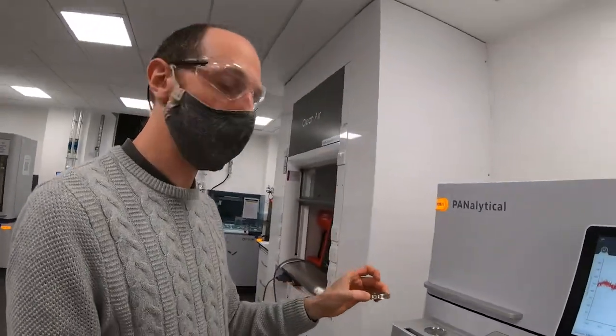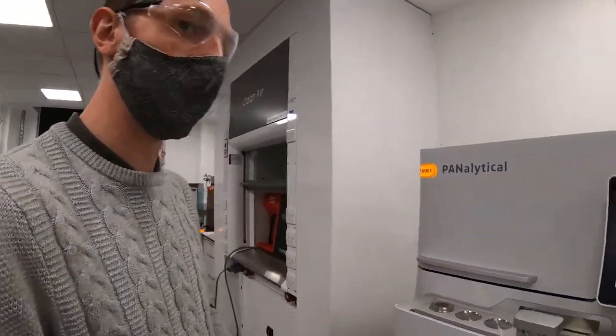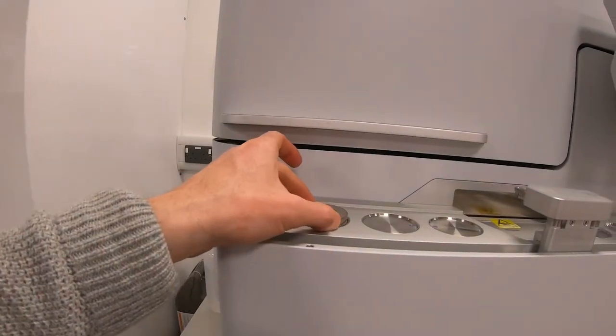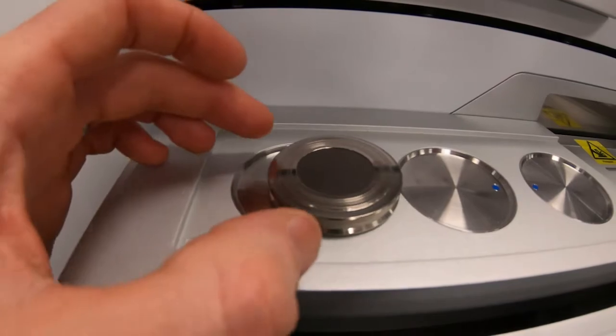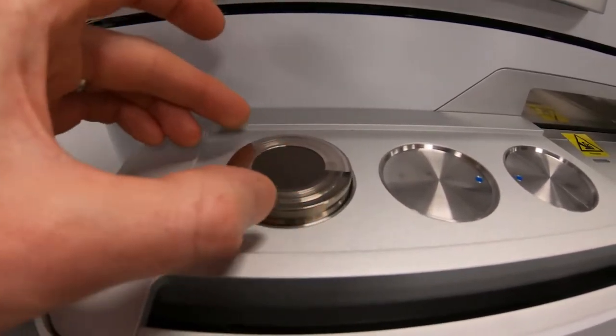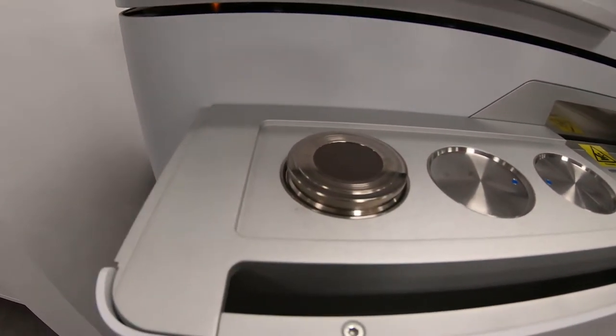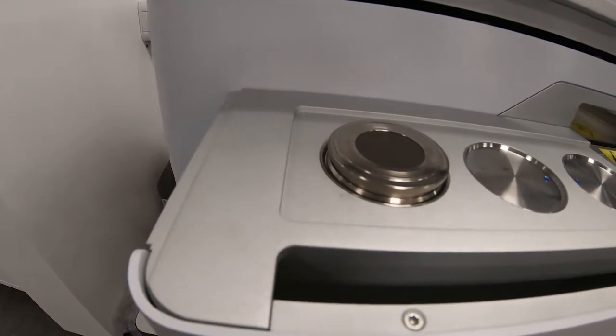So after you've prepared your sample, it's time to load it onto the machine. I have my standard sample here. It's just as simple as placing it into position. You drop it onto the circle, make sure it's nicely centered, not leaning on the edge like that. The machine won't pick it up. It has to be spot on. Once you've done that, you can select which experiment you want to do.